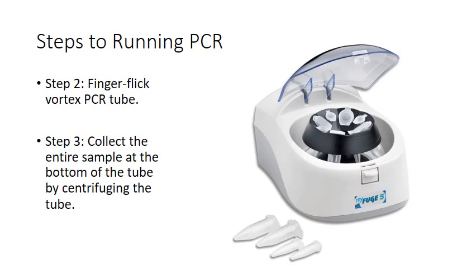This is basically you hold the tip of the tube with your non-dominant hand, and then you flick the tube with your pointer finger on your dominant hand. That is going to agitate what is on the bottom of your tube, and it's going to mix what's inside of it. They call it the finger flick vortex, more like chaos than a vortex if you ask me, but that's what it is. You're just mixing up the stuff inside the tube.